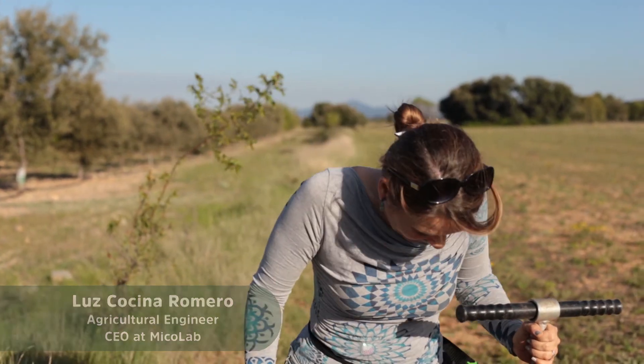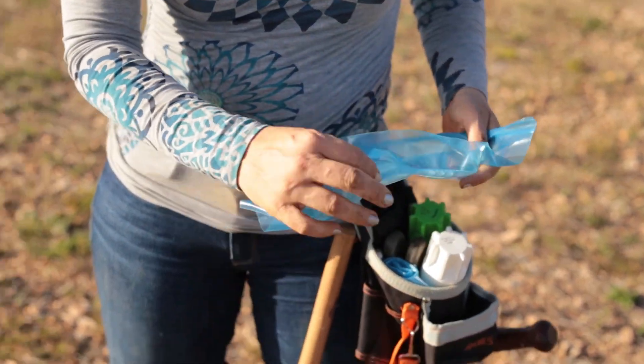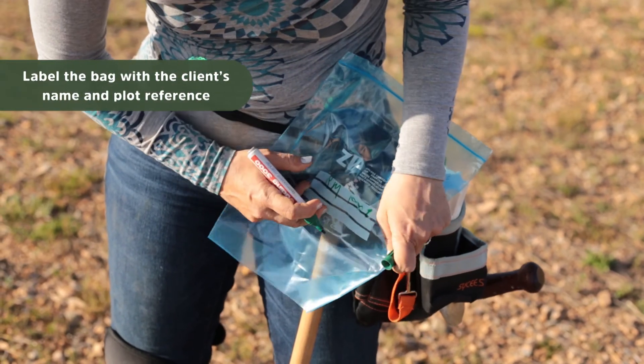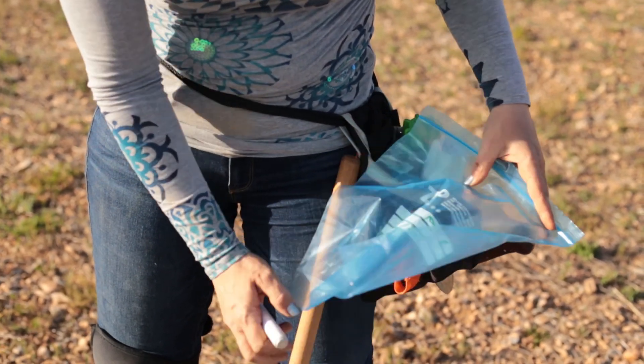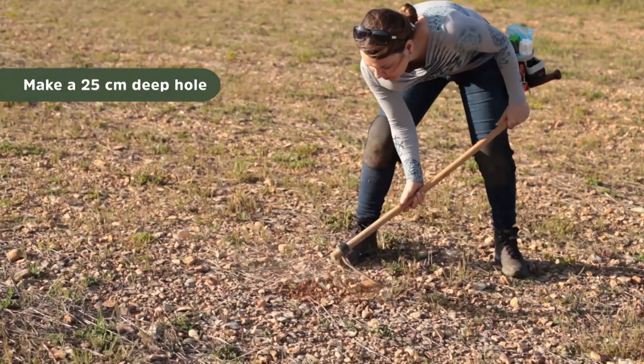You also need to label the bag correctly with your name, and very importantly, the plot name or the plot area — something that will help you to identify it correctly later.